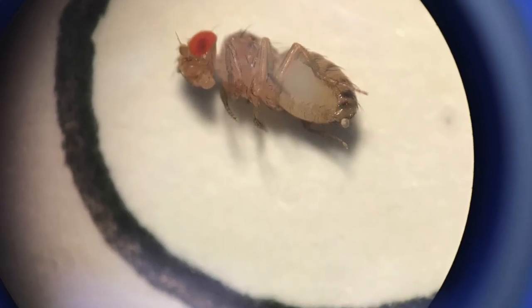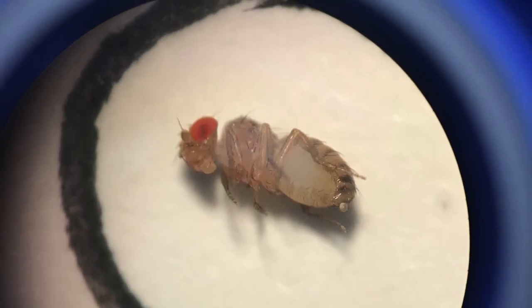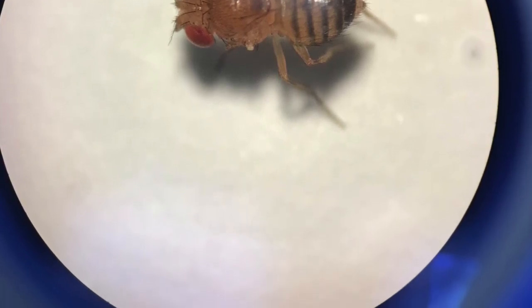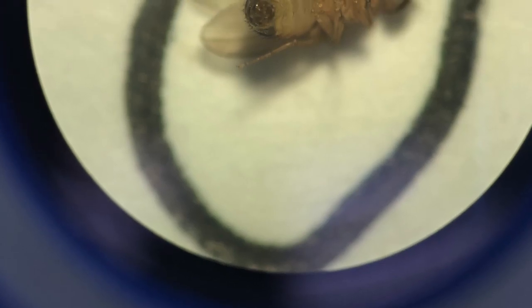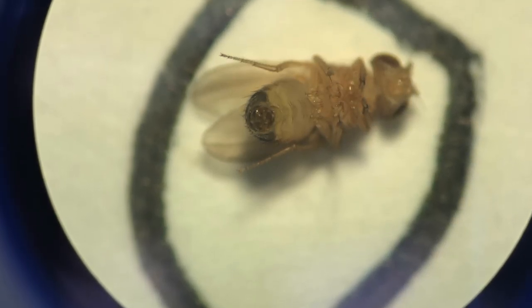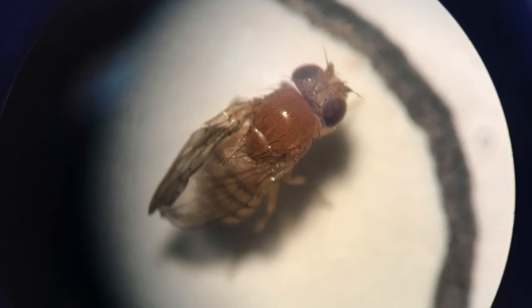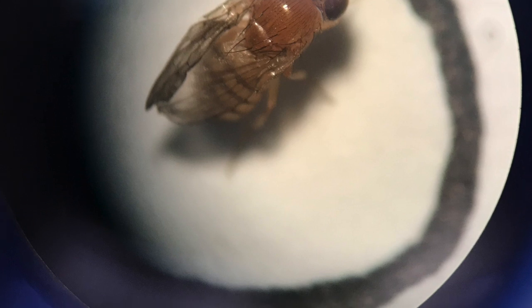Secondly, the red-eye and apterous, or no wings. 3 males and 8 females were counted. And thirdly, the sepia with wings. 20 were male and 22 were female. There could have been a 4th type, sepia apterous, but none were seen.